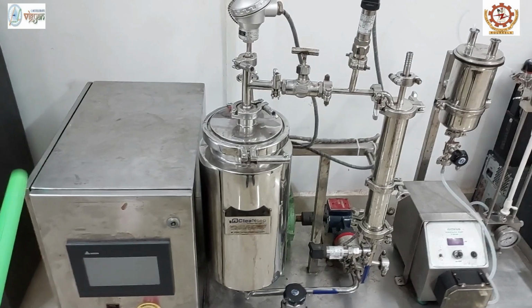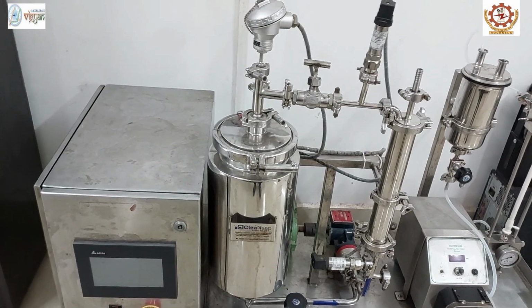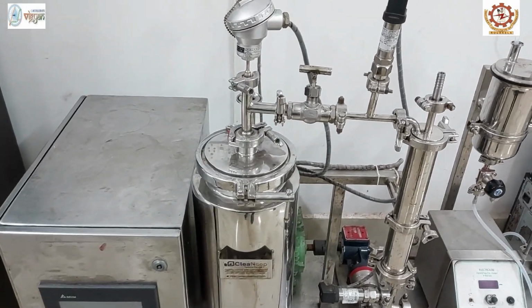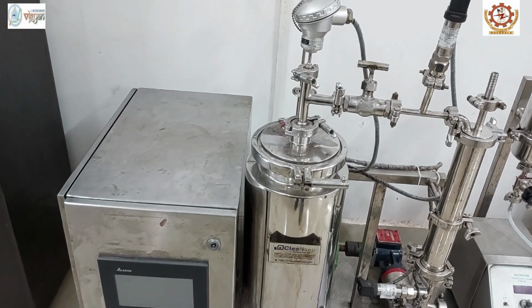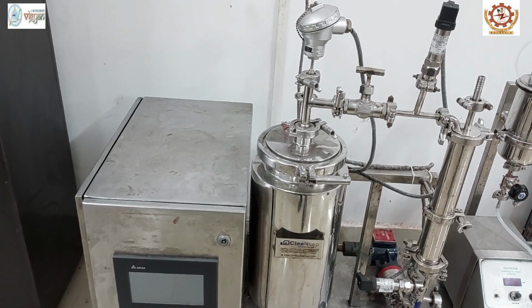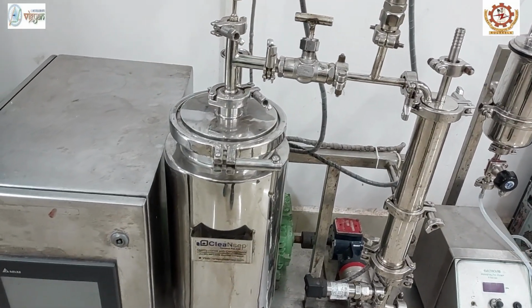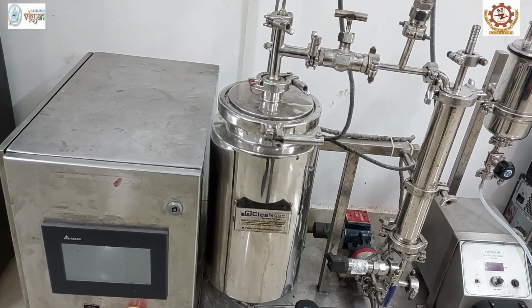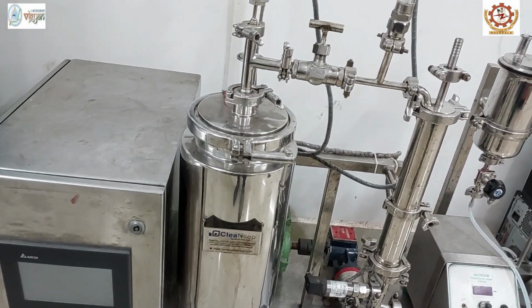And the other part of the membrane filtration system, as I have already said, is used for concentration of fruit juices. Concentration is an essential unit operation in juice processing aimed to ensure lower packing, storage and transportation cost and a longer shelf life. Concentrated juice has less water activity, which makes it resistant and more stable to chemical and microbiological spoilage than the normal juice.